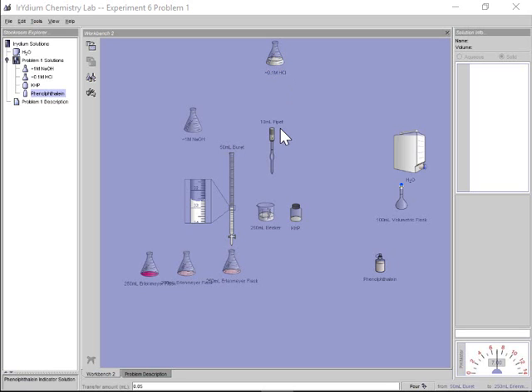Fortunately for us here, because their acid is roughly 10 times less concentrated, if I did a straight titration between the NaOH I had left and the HCl, we're going to find 1 drop of this is approximately 10 times as concentrated as this. The color is going to change really, really quickly. Again, what you're going to try to do is dilute the concentrations down, roughly speaking, so they're similar. If I use 10 mL of my HCl, I want it to take roughly 10 milliliters of NaOH.